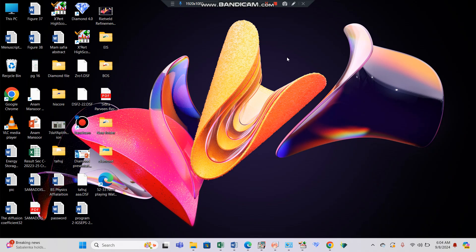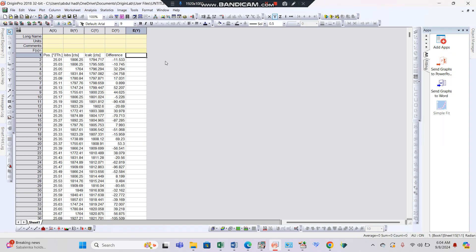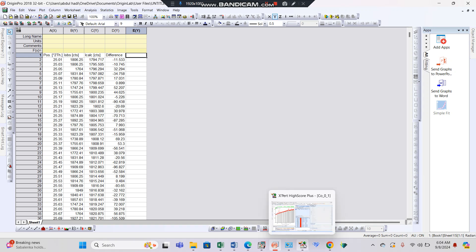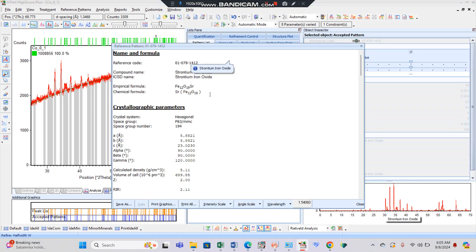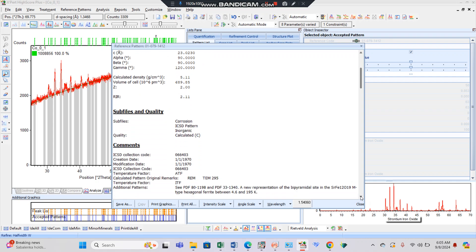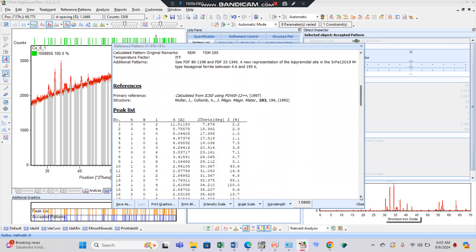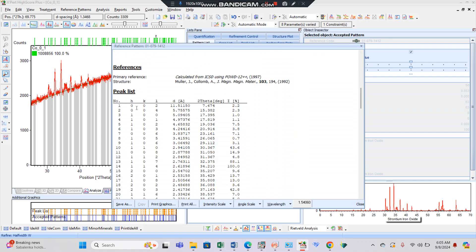Bismillahirrahmanirrahim. This is the continuation of the previous video. We were working on the origin and the standard JCPD card. Clicking this Expert HighScore and opening the standard JCPD card of strontium hexaferrite. As you can see, the values of the peak list contain hkl values, D-spacing, 2-theta, and intensity.